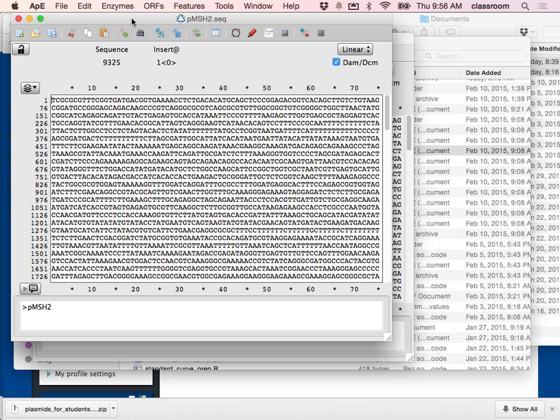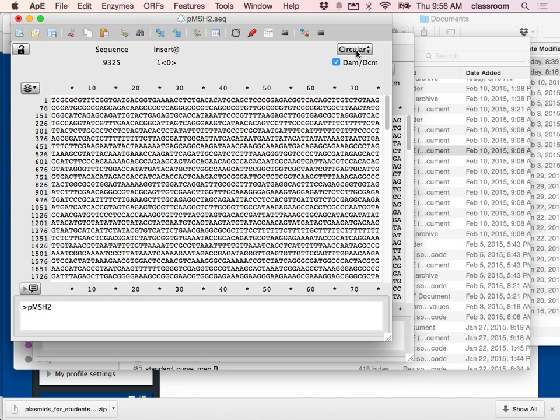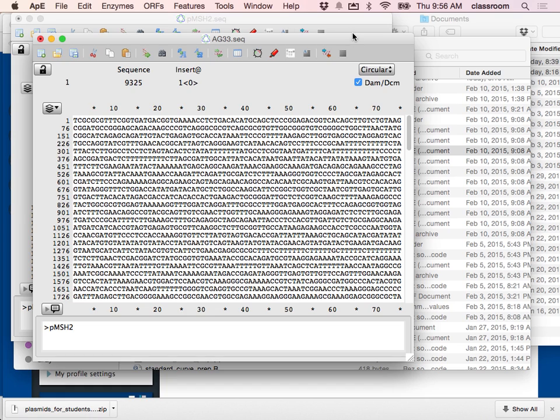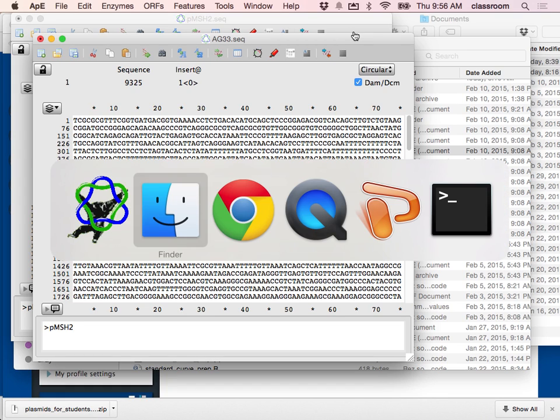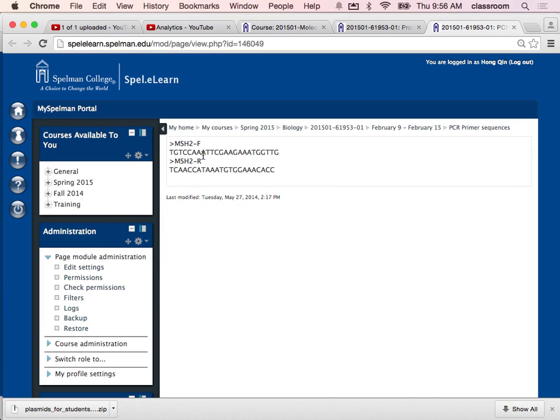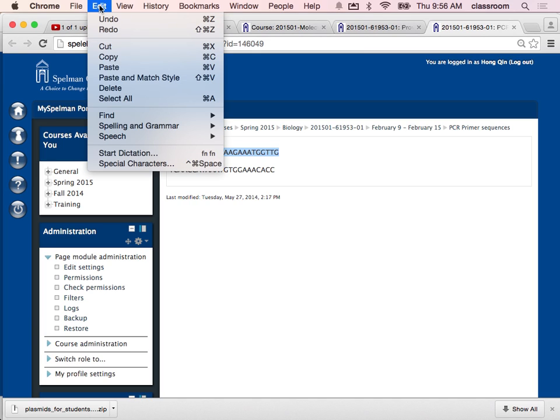Let me go to the wild type first. The question is: given the set of primers we were given, what is the PCR product going to be? Remember this is a plasmid, so it is circular — make sure both the wild type is set to circular. I go back to Moodle and find the forward primer, then highlight all the forward primer sequence and copy it.